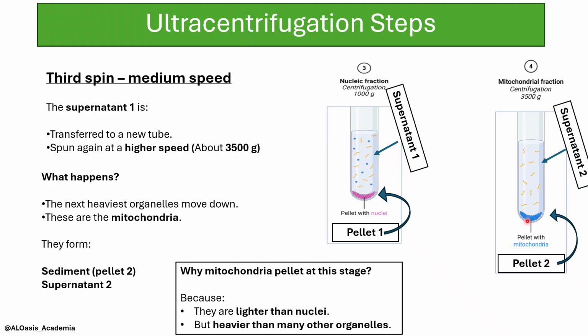And now we see why cell fractionation is a very important process, because it allows us to reach this point where, if we are interested in studying mitochondria, we will be able to separate the mitochondria from the rest of the organelles and do some independent studies on it.